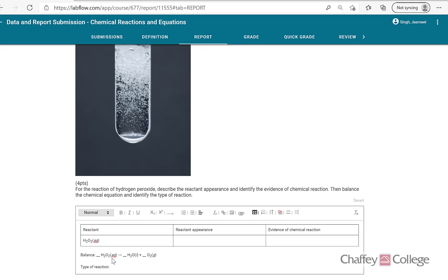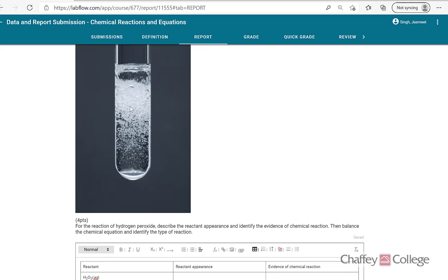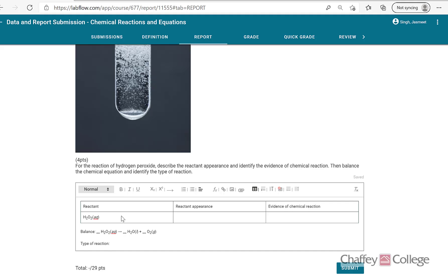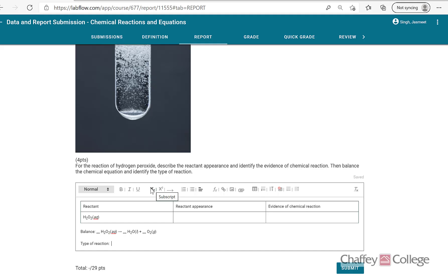The sixth reaction involves sodium hydrogen carbonate — also known as baking soda or baking powder — and hydrochloric acid. Watch the video, look for the evidence, and complete the equation. The seventh and final reaction is hydrogen peroxide decomposing — you can already see bubbles, which is evidence of the reaction. Hydrogen peroxide is a colorless liquid. Balance the equation; you can see it's AB breaking down into A and B, so it's a decomposition reaction. Once complete, hit submit and we're done. If you have any questions, please send me an email.